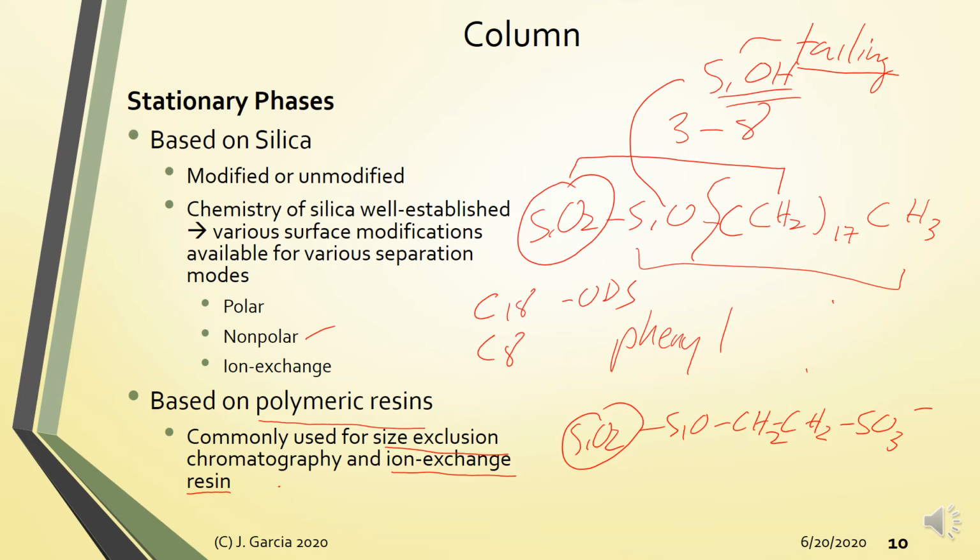Especially when you're using basic mobile phases or a lot of water, water cleaves this bond also. So you need to be very careful and really observe the proper storage conditions and proper operating conditions for your column.